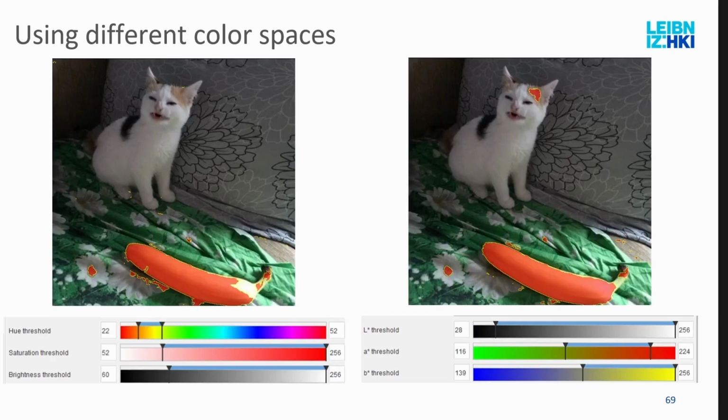And then this way allows me to easily pick out the yellow through the manual thresholder. So I tried my best here, but you see here it's not perfect. It did not fully cover the banana, but the Lab space, I almost fell over that, covers the banana way easier. You just have to play around with these manual thresholds.